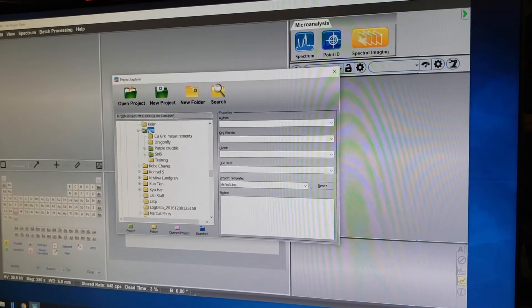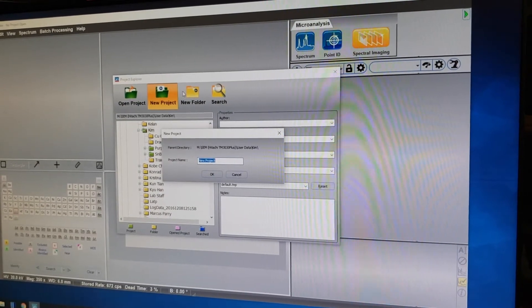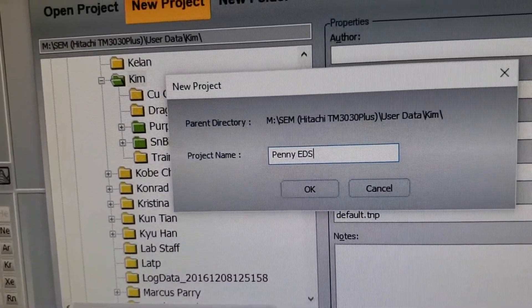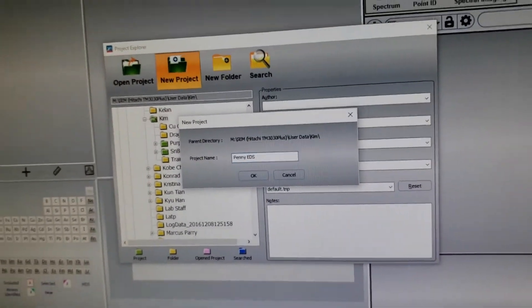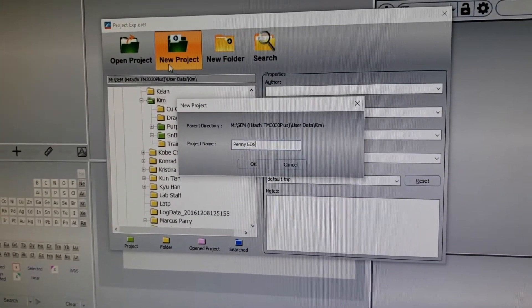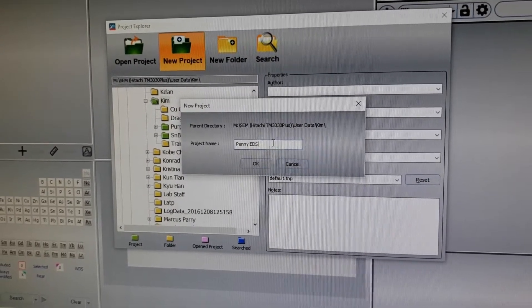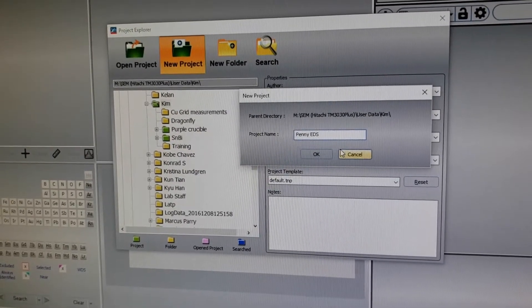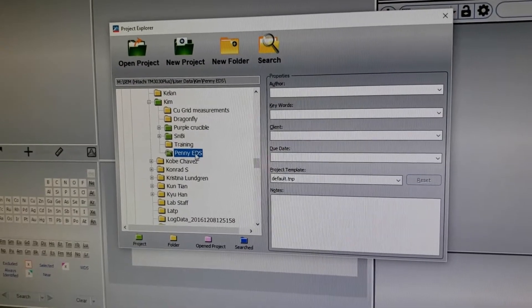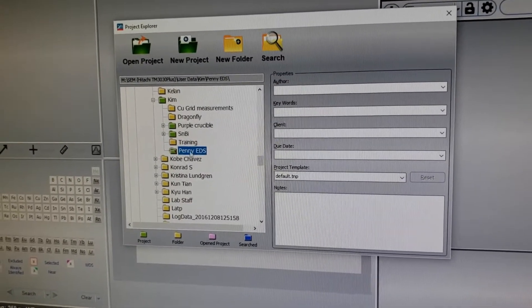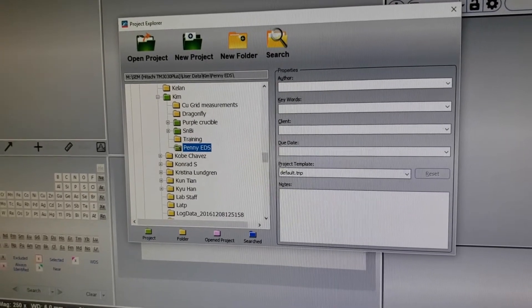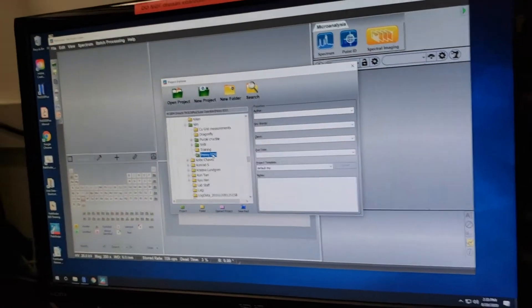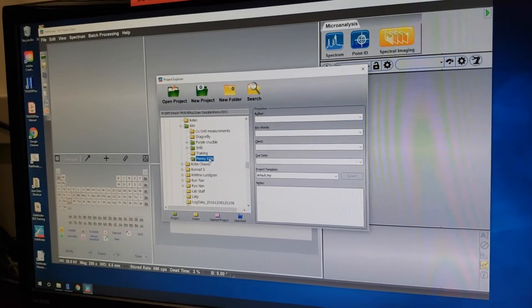We're going to find the machine that we're on, open user data, and scroll down to your folder and save a project under there. Some folders have green on them, which means there is EDS data within those folders. I typically click on the parent folder, create a new project, and name it something with EDS in the name — for example, 'Penny EDS.'